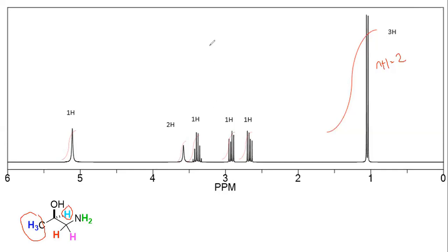All right. Let's do this proton right here, the turquoise proton. This one. How should that be split? What do you think? And where should it show up? So let's think about it in order. First of all, where should it show up? Secondly, how should it split? Thirdly, what should the integration be? Those are 3 things that we're going to always do for each one of these signals: where it shows up on the spectrum, the splitting pattern, and then the integration. So what do you think?